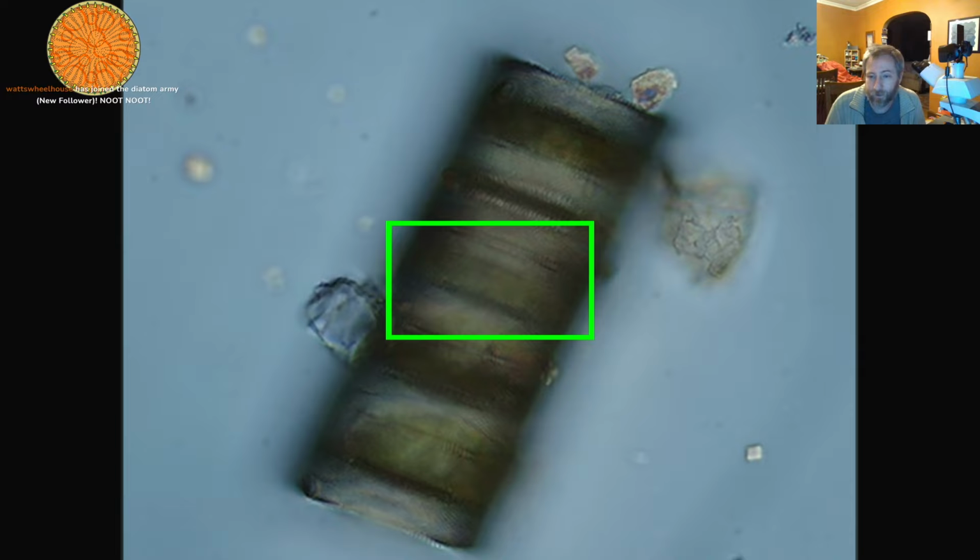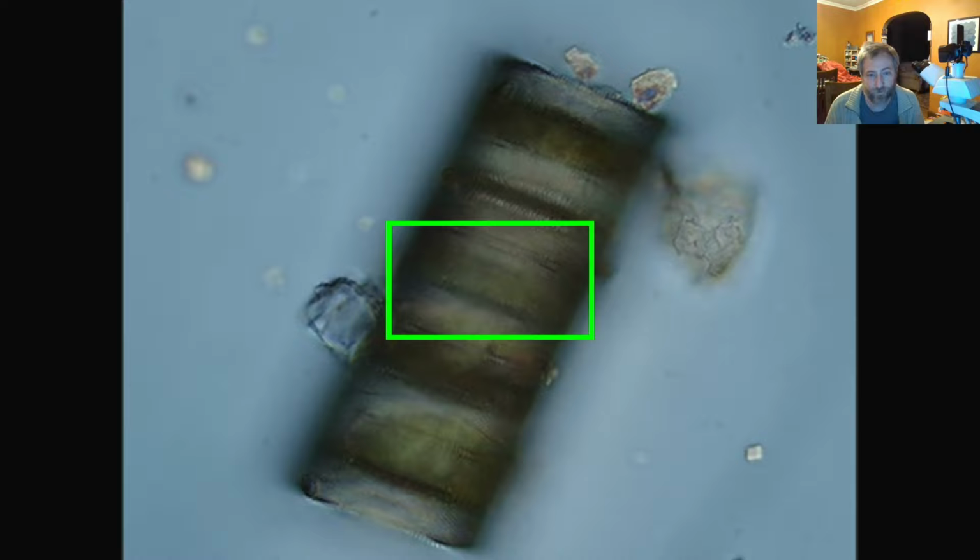So I never had any idea from her what the site was or anything. She just gave it to me, and I basically reconstructed the environment based on what I knew about diatoms, which is kind of a lot. It's that sort of process that allows me to figure it out. And then when I asked her, hey, where's this come from? She's like, oh, it's a power plant. And then I looked it up. There's this rocky waterfall right in front of the power plant. I was like, every part of what I determined was true.